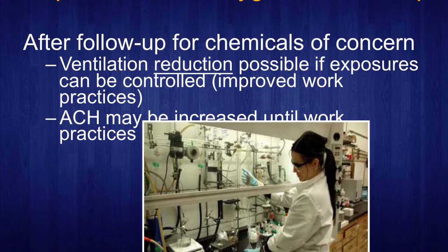And after this follow-up for chemicals of concern, we find that frequently a ventilation reduction is possible because we can improve their work practices. But conversely, sometimes we raise those air change rates because we have not been able to.